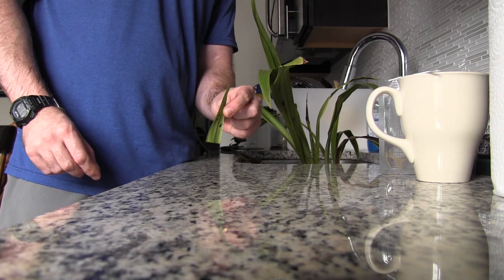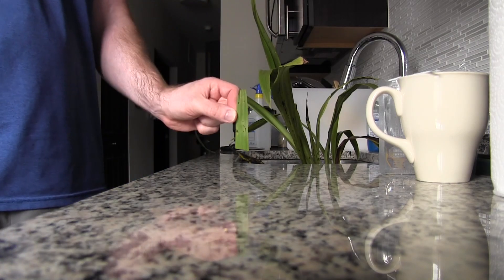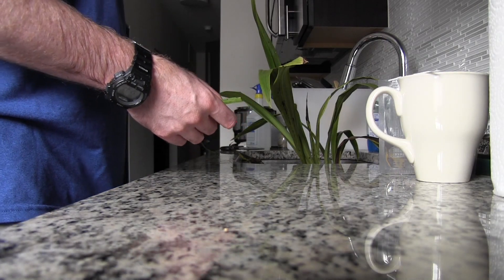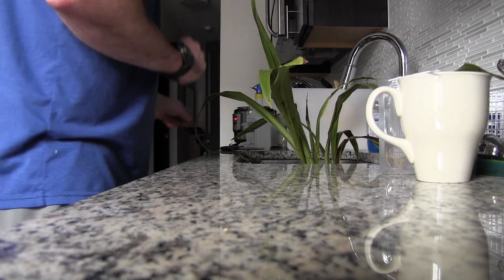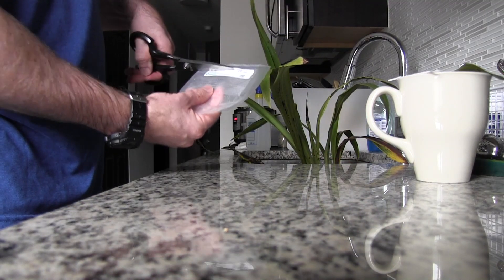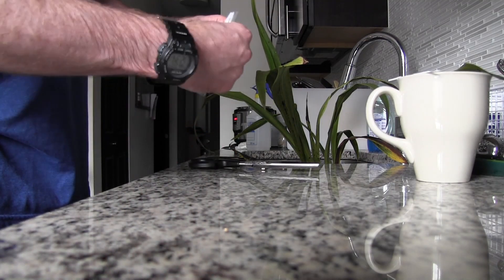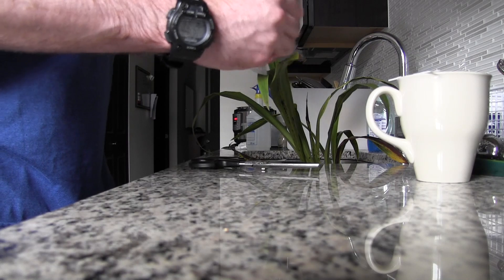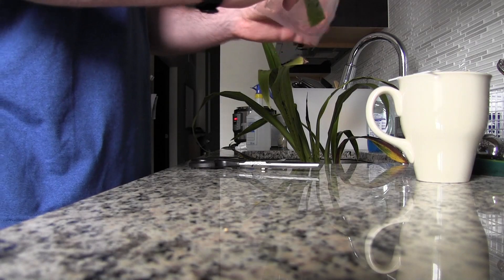Agdia, which is the maker of these virus test kits, recommends a quarter-sized piece of plant material, so that's more than enough. Then I'm going to open up the test packet and drop my piece of leaf in all the way down to the bottom and move it down into the solution.